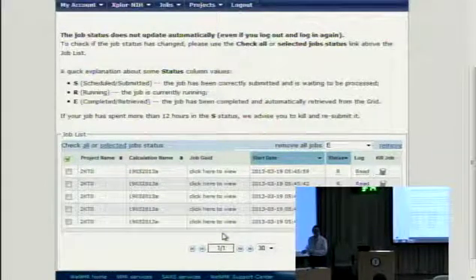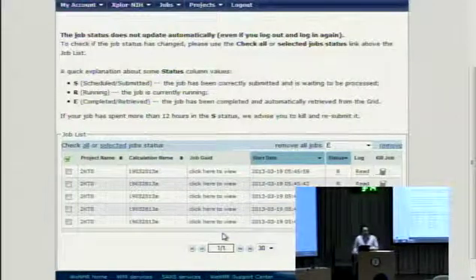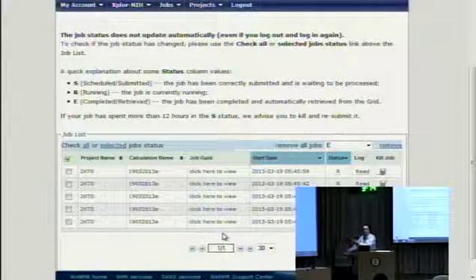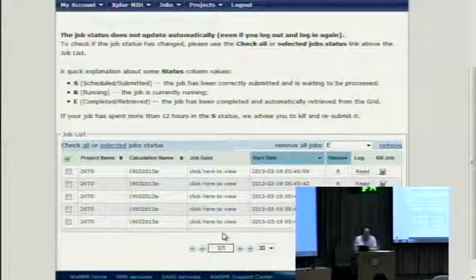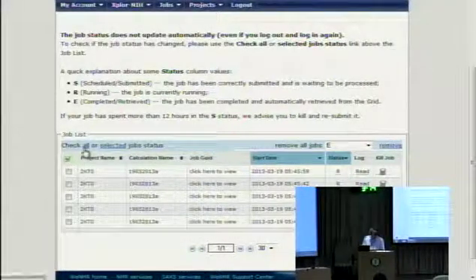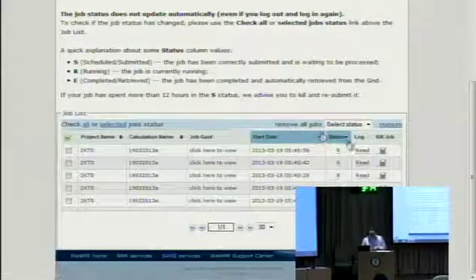That's why we don't do that automatically, because otherwise every time you open the page, you just stare at the thing going in wheels for 3 minutes. But now that's actually what we want to do. So we say check all, and we see what happens. So it's still running. We will have to wait another little bit.